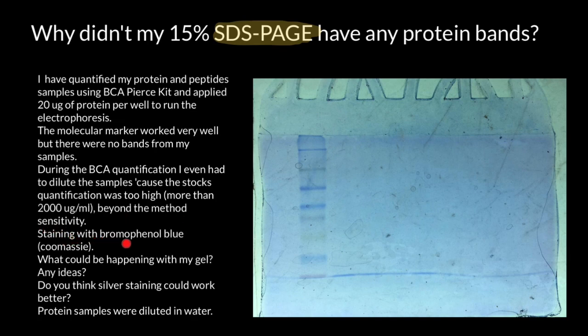Staining was done with bromophenol blue and Coomassie. What could be happening with my gel?